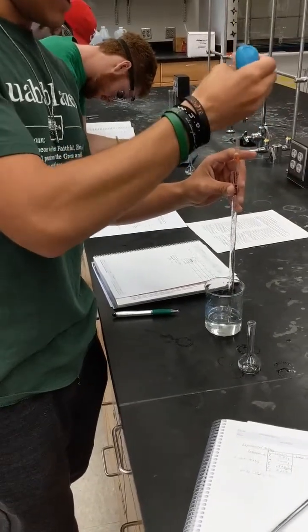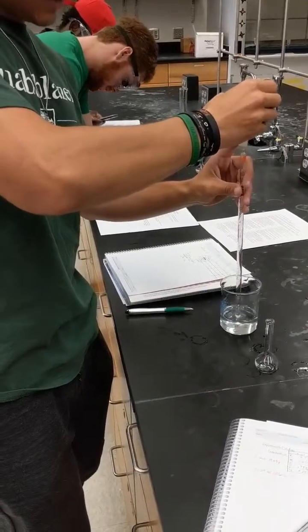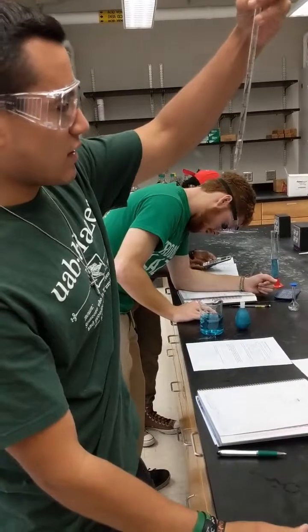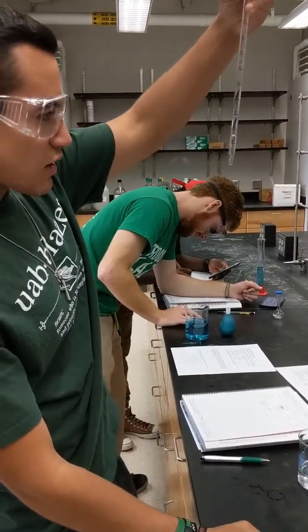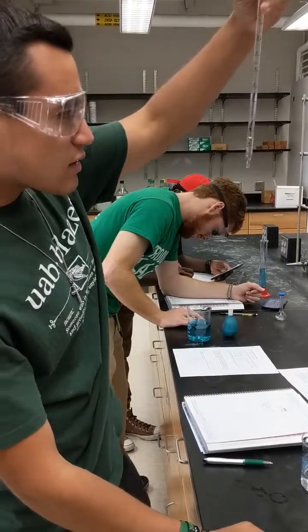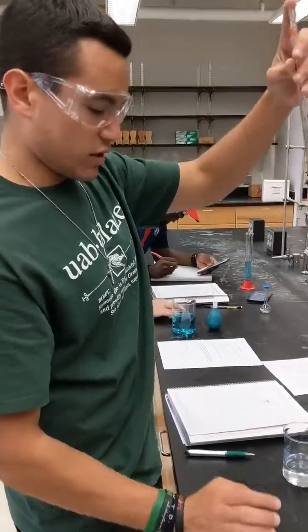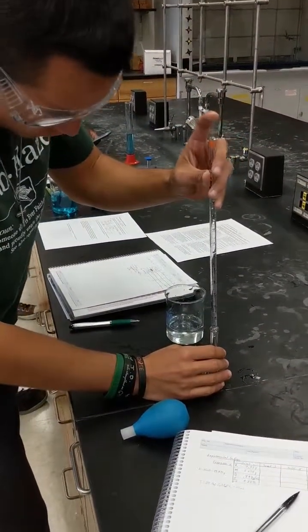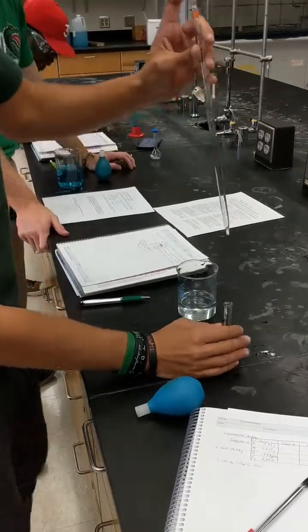Alright, so we'll take out our stock solution, measure it. It's about 8.5, so we'll put like 8.51 just to be safe. Place it into the volumetric flask, and then we measure it.